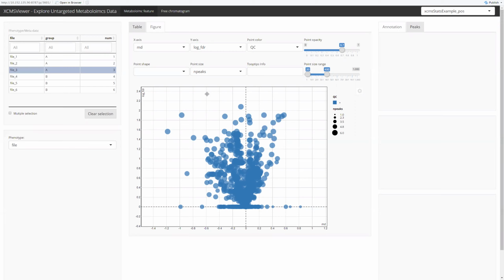If you use it, you will know by heart. The most interesting part of this plot will be the top left and top right corners. They have low p-value and high fold change. But because this data is unpublished, I won't click through those points. I think many of them are very interesting.